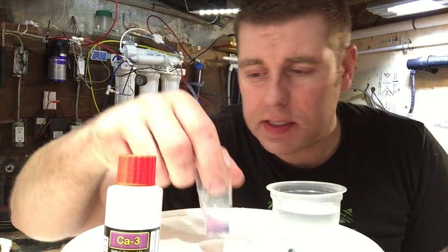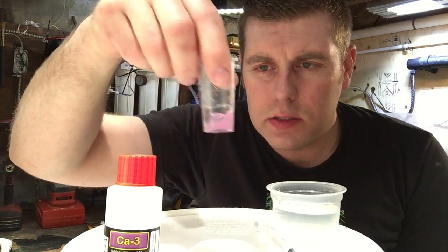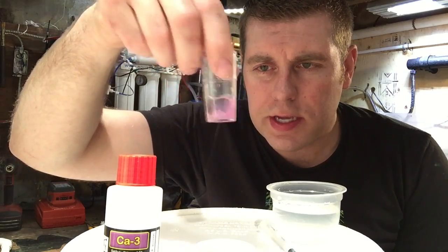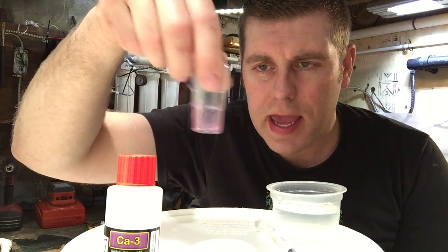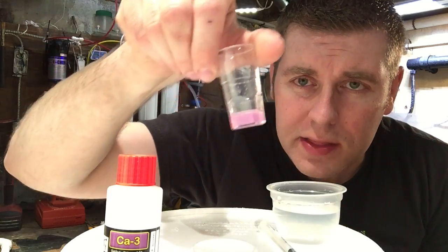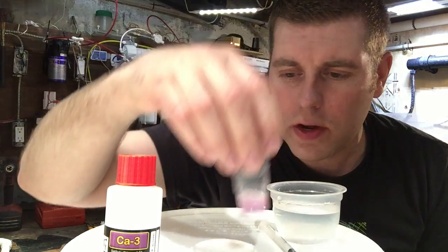Now we're gonna mix this for ten seconds. Ready? One, two, three, four, five, six, seven, eight, nine, ten. Alright, it's all mixed. You see how it's all pink there? That's good — that's what you're looking for. You want your pink.